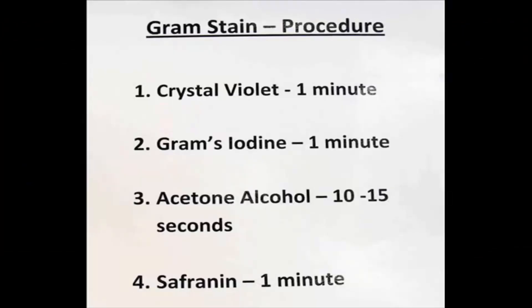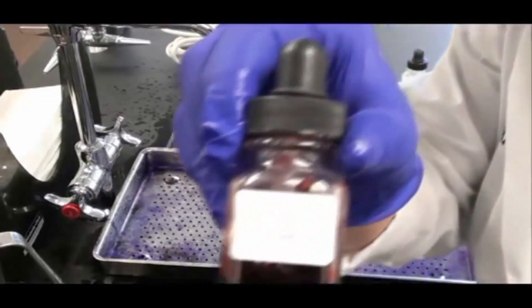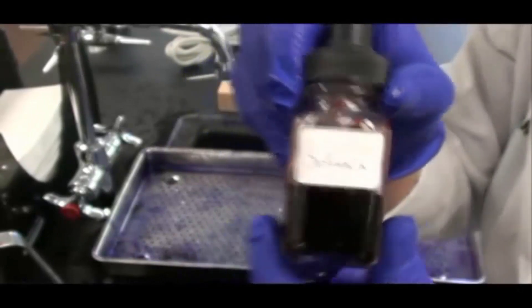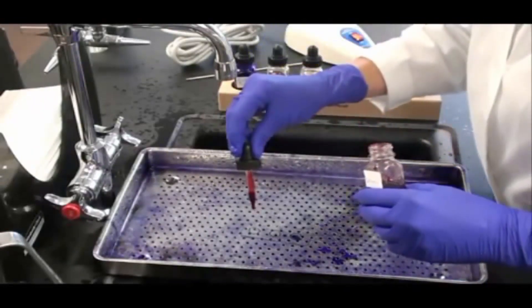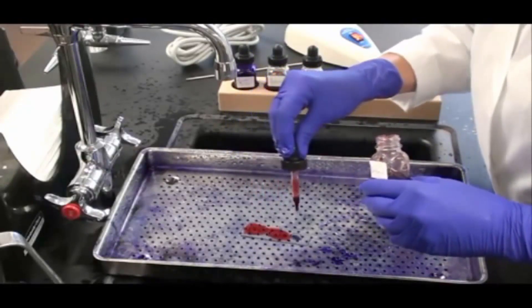My last step is going to be applying safranin. This is a counter stain. My Gram-negative bacteria don't have any stain in them at this point and I need to add a stain so I can see them under the scope. We use safranin as a counter stain because it's pink in contrast to the purple crystal violet. I let the drops of safranin fall onto the slide, making sure I cover all three bacterial smears.